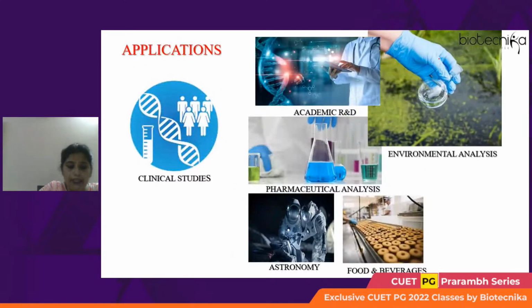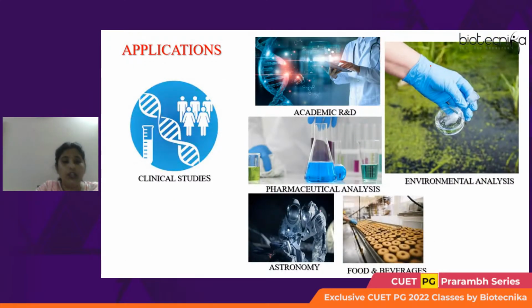So what is the application of spectroscopy? We use spectroscopy in the food industry for measurement of different compounds which can be present in food samples. Then in academics, we widely use it to determine the concentration of your DNA, protein, RNA, to check the quality, to check the quantity, right? And one of you asked me, ma'am, how can we measure the quality and quantity. So I would like to explain that point in detail.